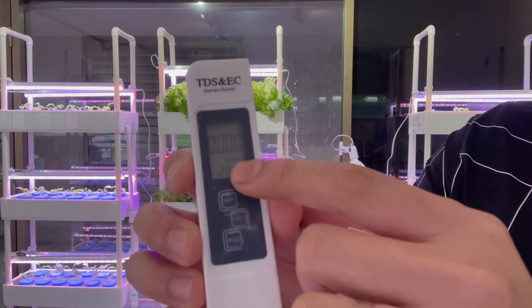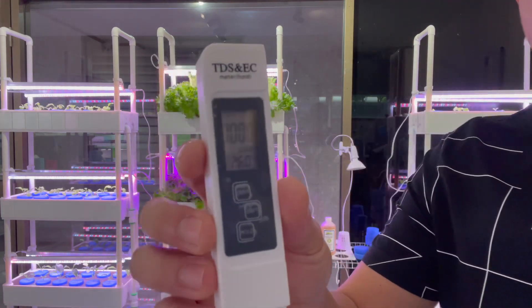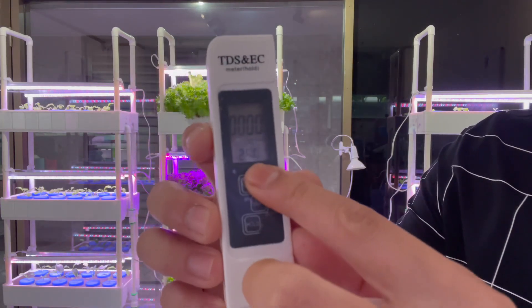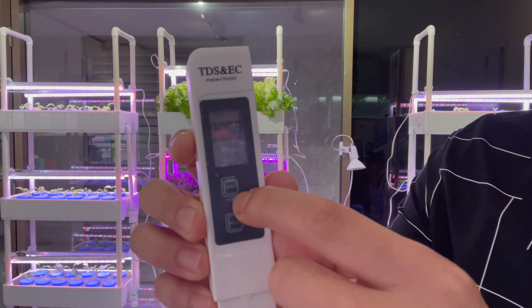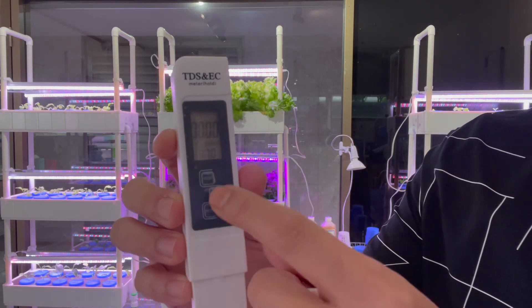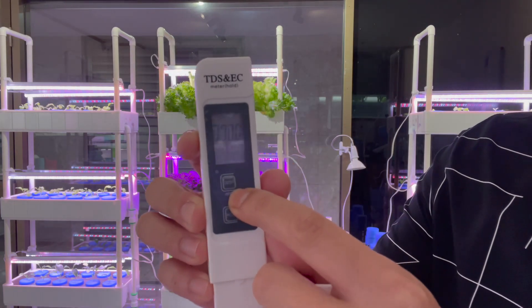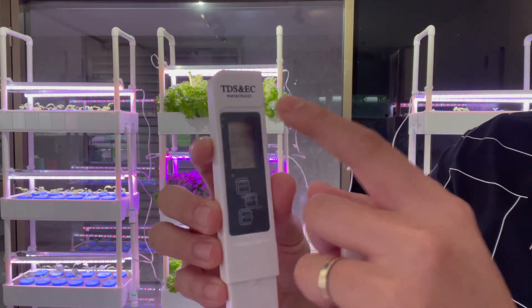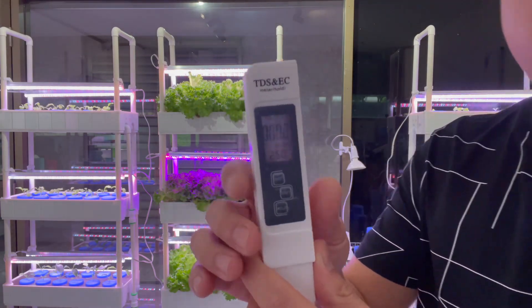It's on µS/cm — micro siemens per centimeter — and also the temperature in degrees Celsius. If it's not on EC, you can press the shift button. Press shift and it goes to PPM. Press shift again and it goes back to EC. The degrees Fahrenheit will keep changing as well. So there are four modes on it. What's important is to make sure that it's on EC unit when you are checking the amount of nutrients in your hydroponic system.